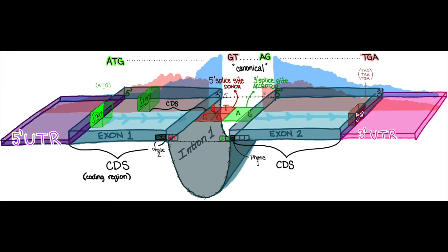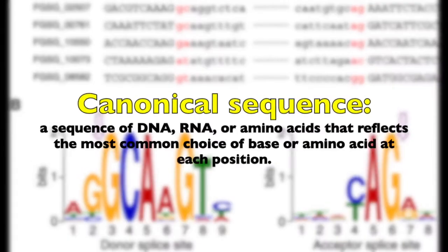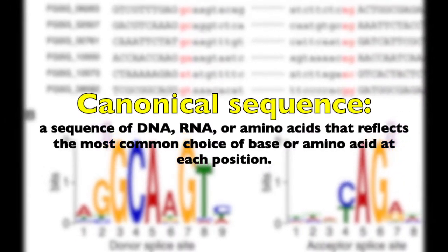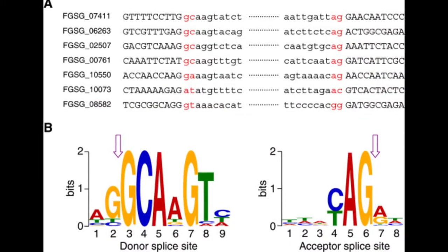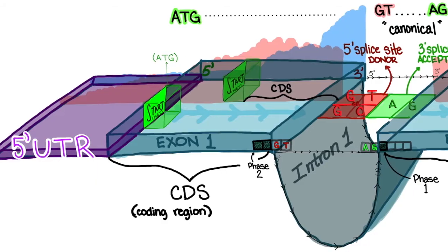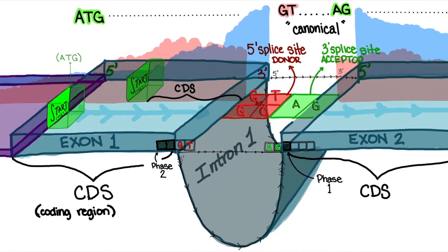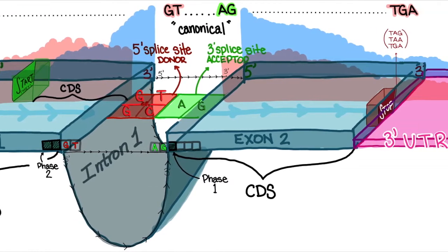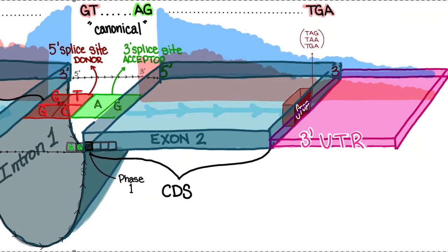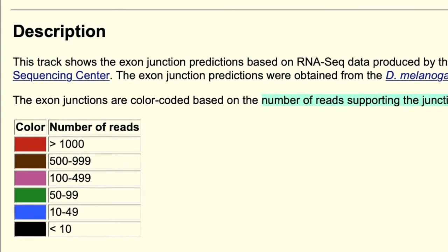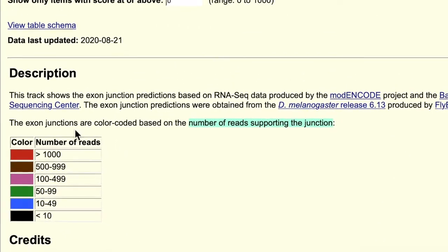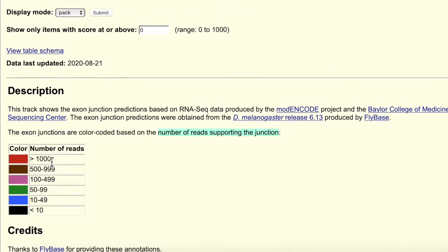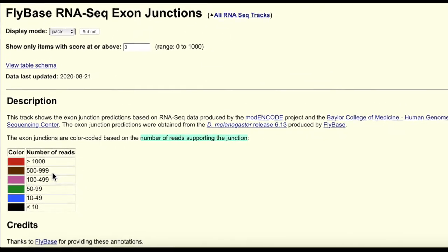The track also takes into account the potential canonical splice site donors and acceptors at each junction, so that there's a GT — and occasionally a GC — starting off each intronic region, and ending with an AG just before the coding region starts back up again. For the splice junctions predicted track, the warmer colors such as brown, red, and pink have the most supported reads, whereas cooler colors like green, blue, and black have the least.